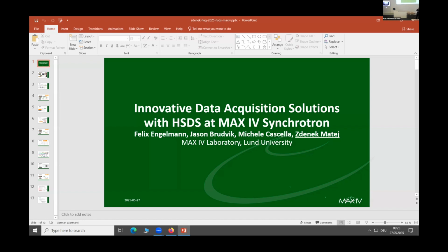Okay, there's a couple more questions online. Andy Gotts is asking, are you able to have concurrent access to files while they are being written? We are not writing any files at all. In the data acquisition that I have shown, we are not writing a single file.